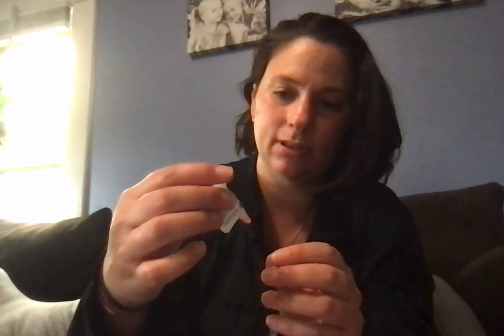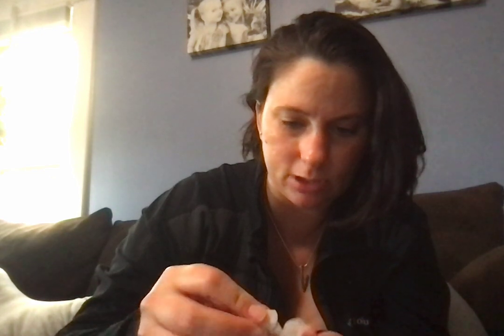And then I had dextrose, which you can see the color change there. Really nice orange color. See the precipitate that's formed as a byproduct of the oxidation of these sugars. And then we have fructose, which looked to me like it oxidized the most, or it was the highest concentration, because it turned the darkest orange. And yes, I'd still say that looks to be the darkest.